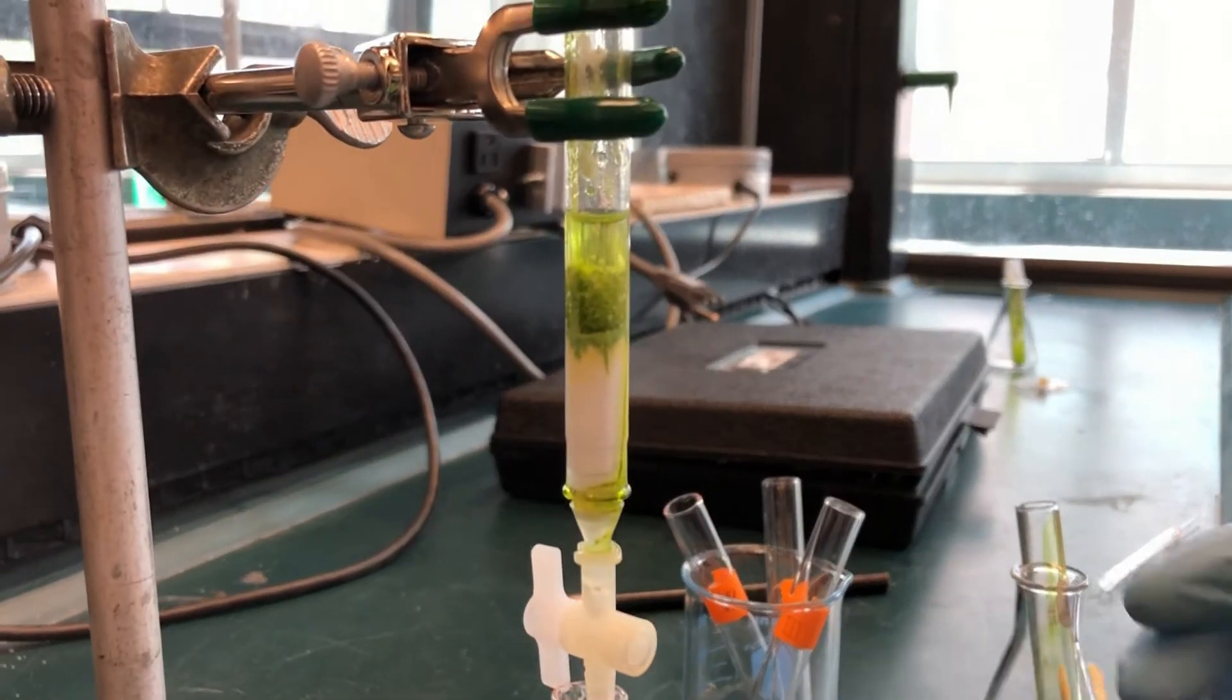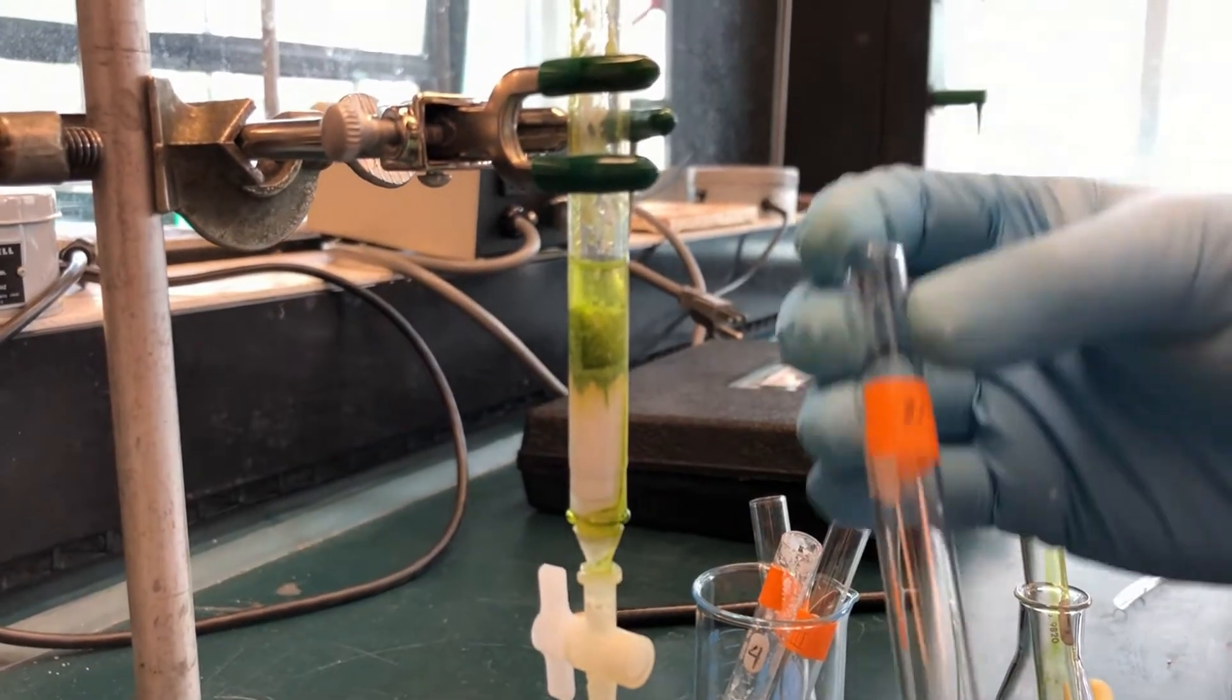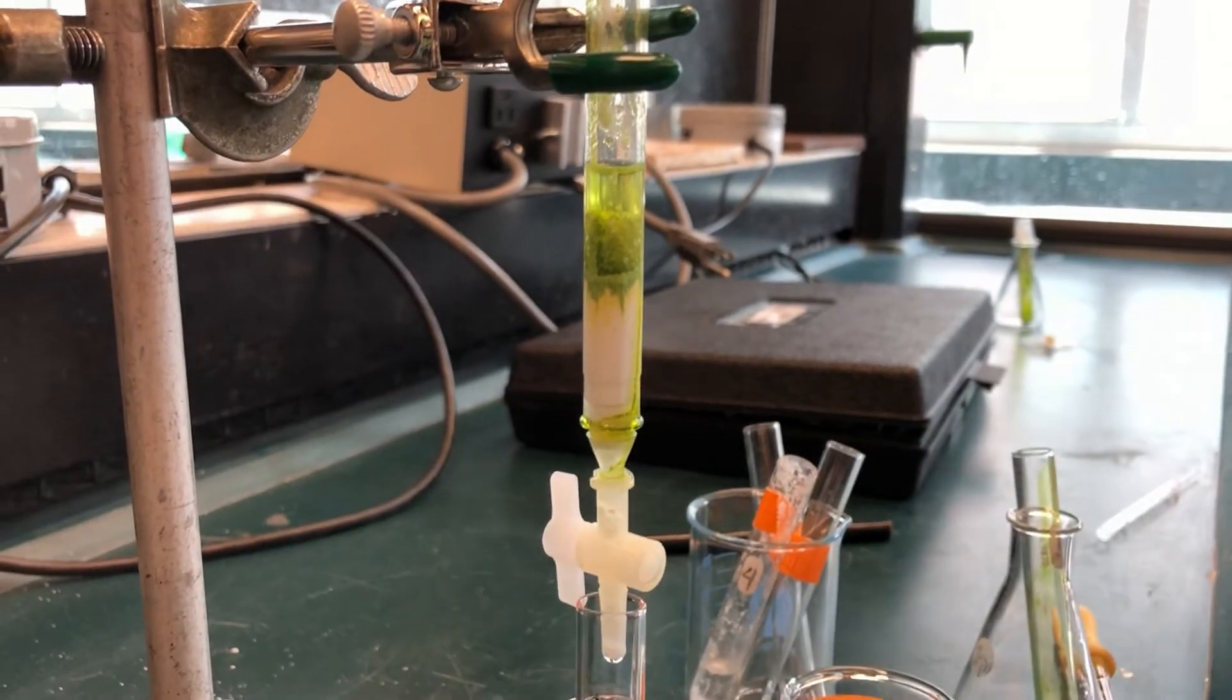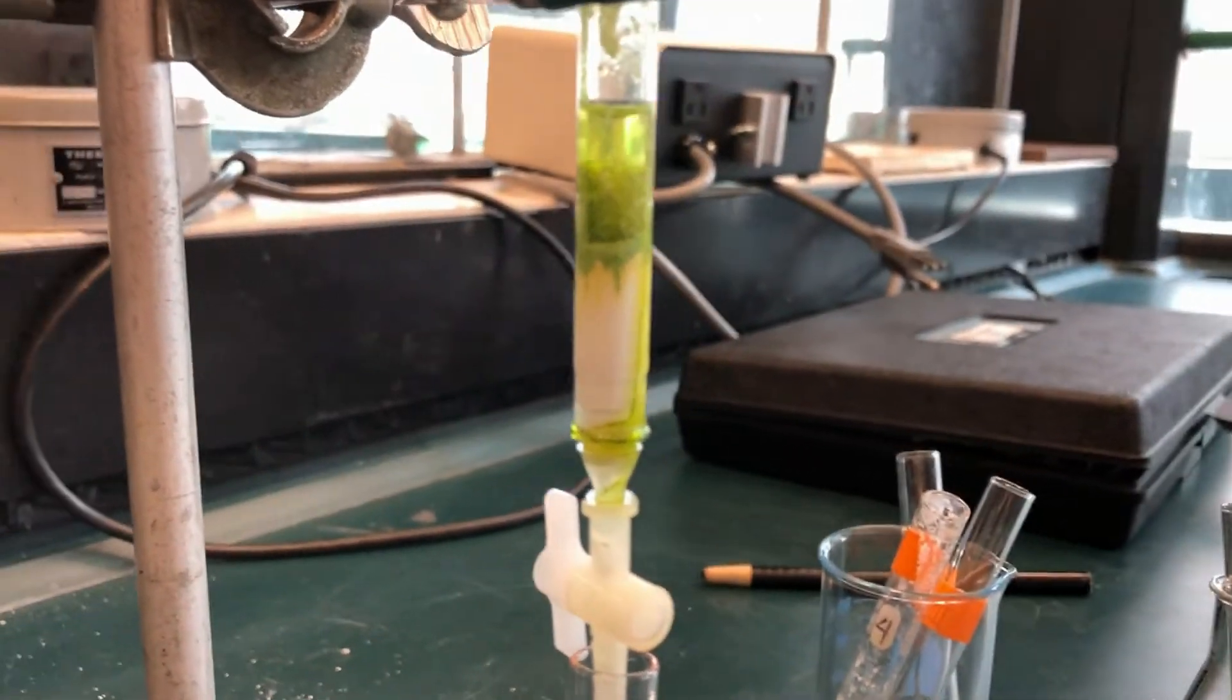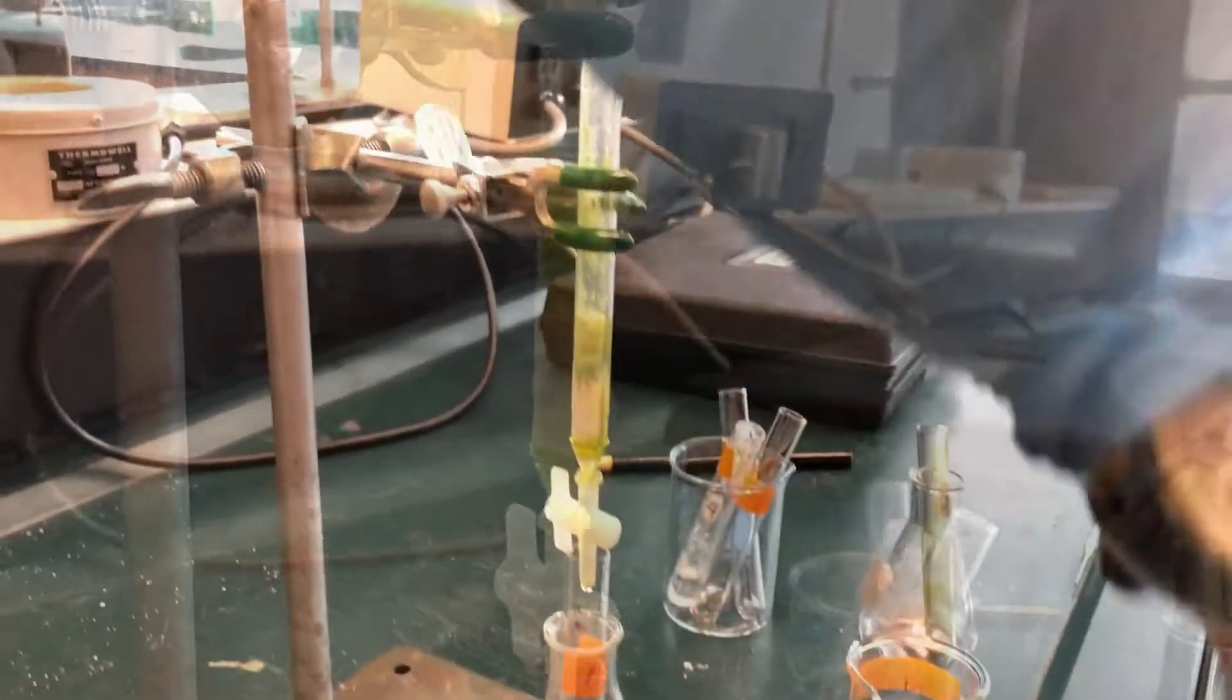If the yellow band does not separate from the green band, then change to a more polar solvent, such as the 70-30 petroleum ether until the yellow band passes through the column.